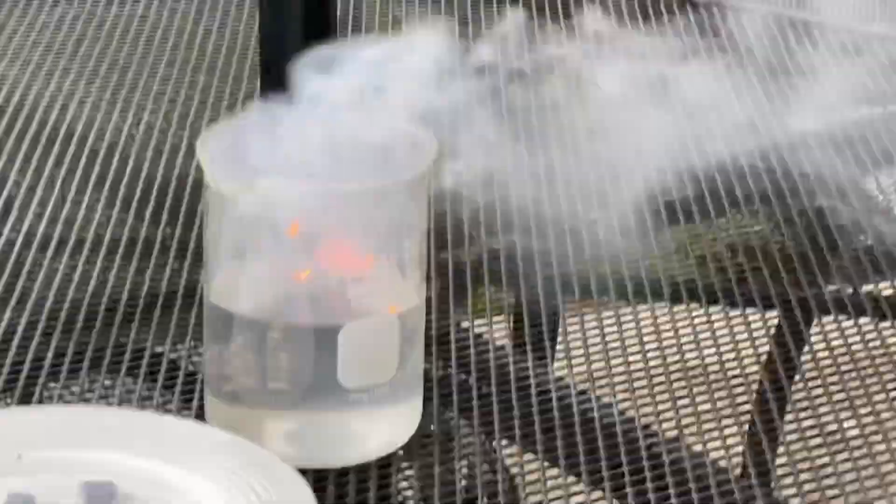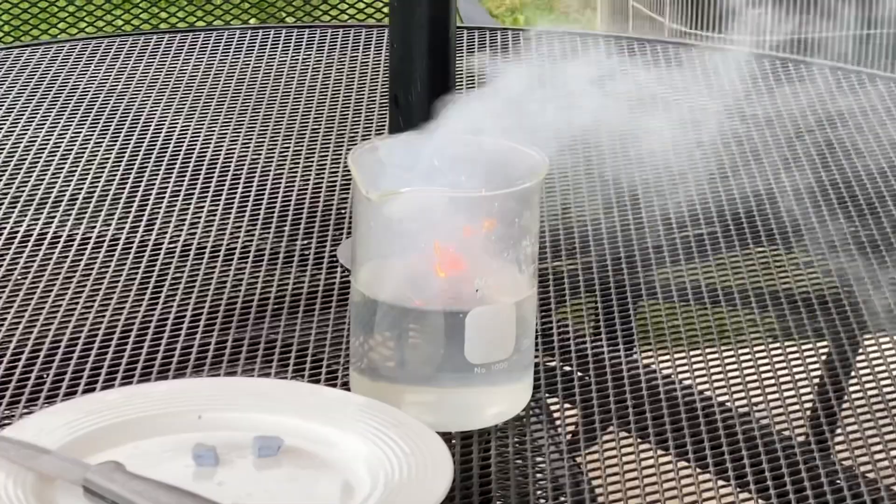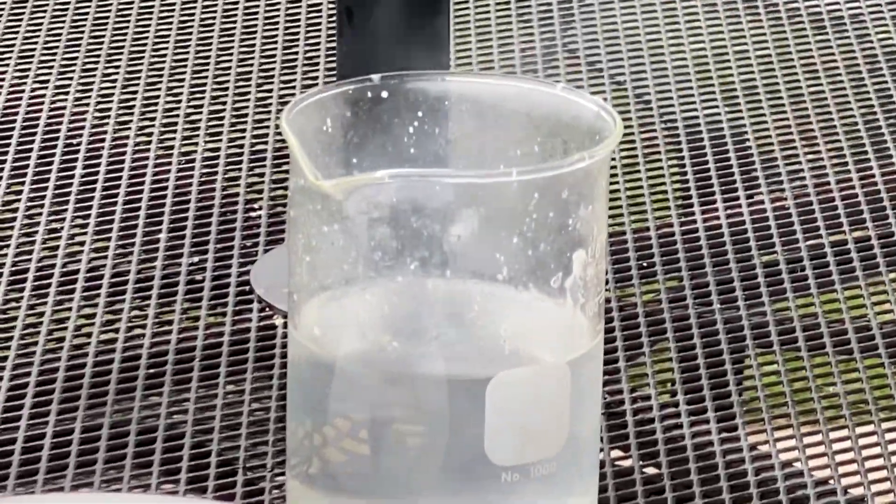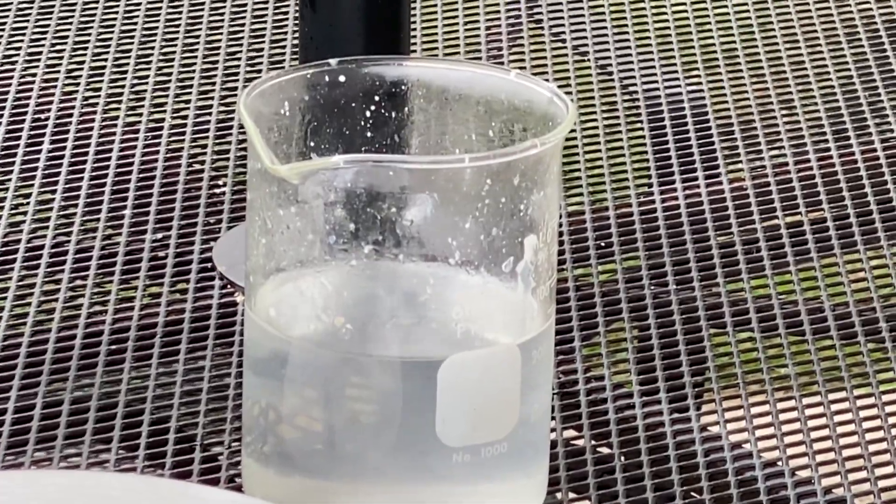You see it burning on the surface there. Very reactive. Amazing. Potassium in water.